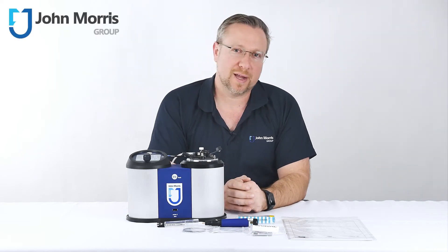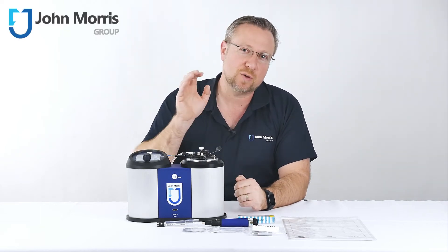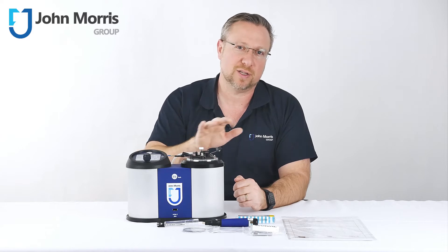Hi, I'm Andre from the John Morris Group, and today I'd like to introduce the Stanhope Seta Series 3 Flashpoint Tester.